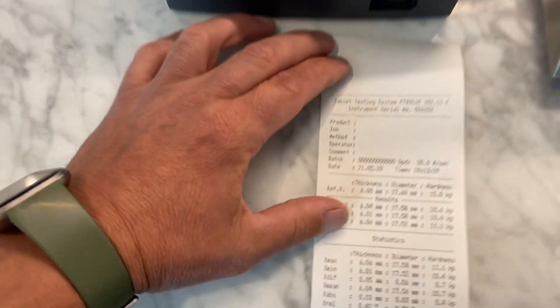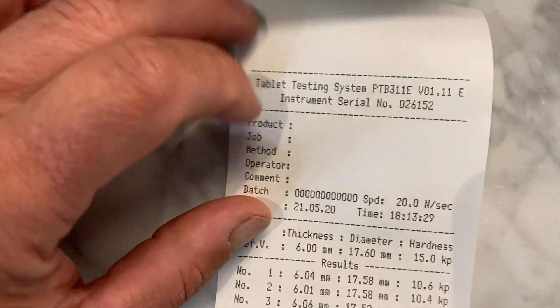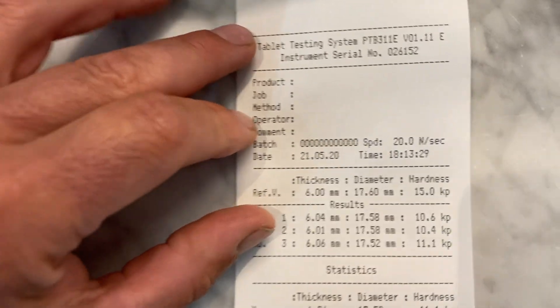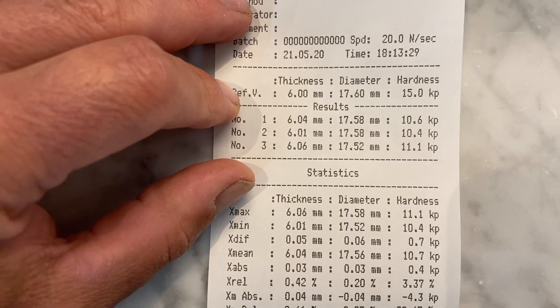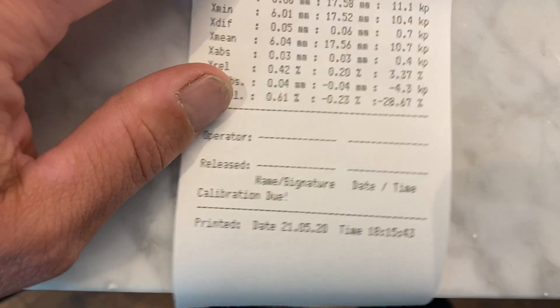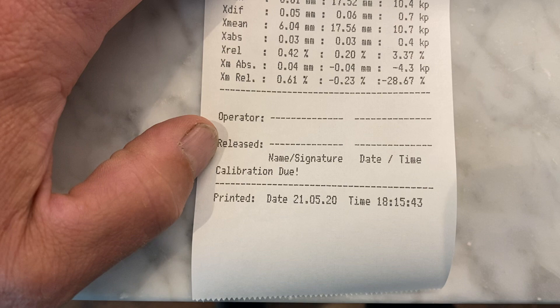The results of the test are shown. Here we can see the serial number of the unit, any information with respect to the product name, the operator's information, if we'd entered in a lot number or a batch number, a time and date stamp, the target values for that particular tablet, the test results, the statistics, where the operator can date it and sign it.